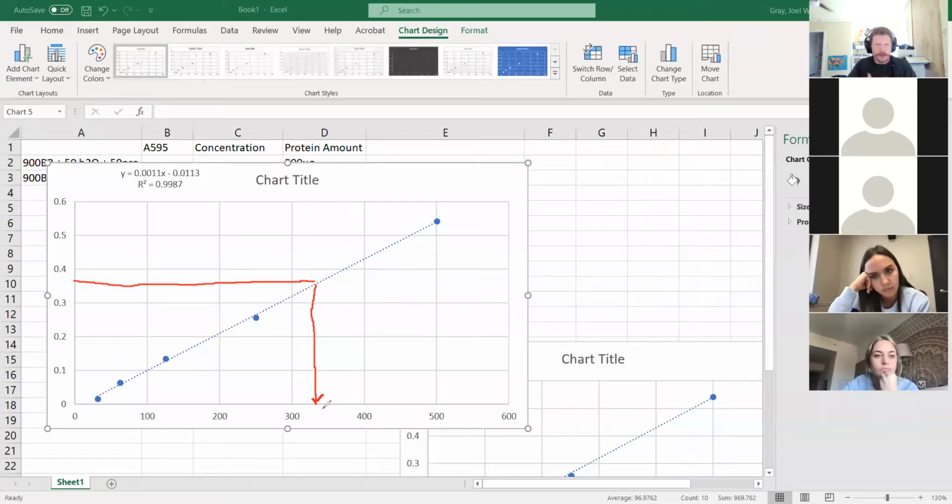you kind of have to be a little bit dynamic based on what you have of your sample. Because if you have a very limited amount of your protein sample, well, then using 50 microliters of it might be problematic. Does that make sense? Okay.